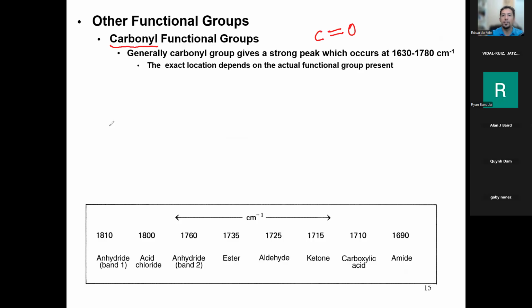Well, my name is carbonyl of the amide group. My name is carbonyl of a carboxylic acid. My name is carbonyl of a ketone. My name is carbonyl of an aldehyde. My name is carbonyl of an ester. All of these groups are independent functional groups, but they all contain carbonyl. So it's like a last name, right? But backwards, depends.